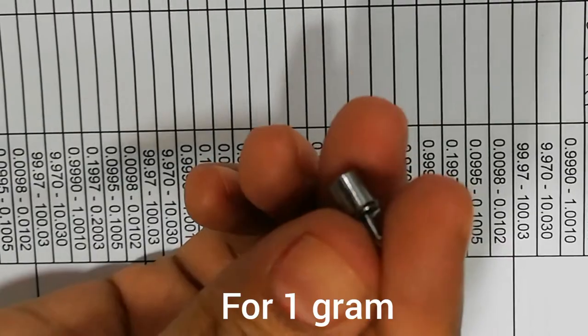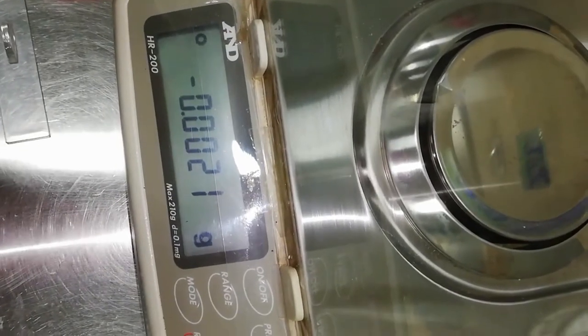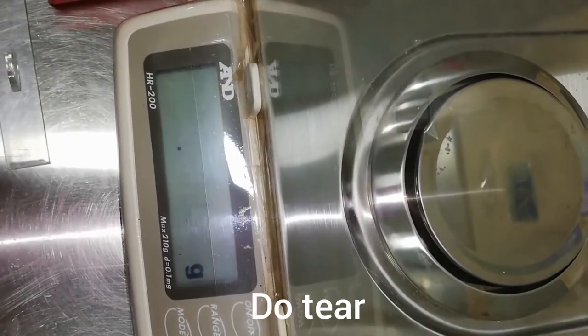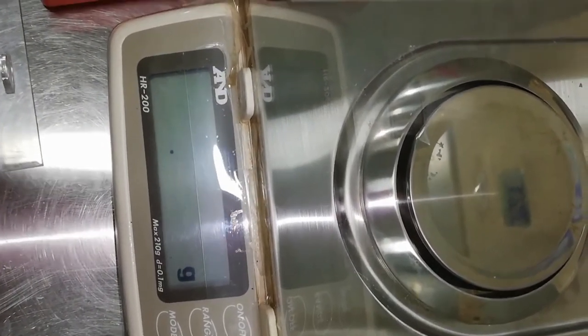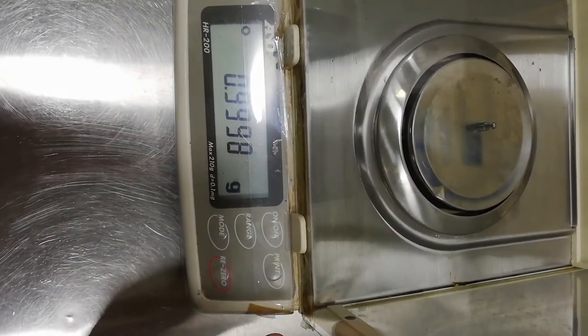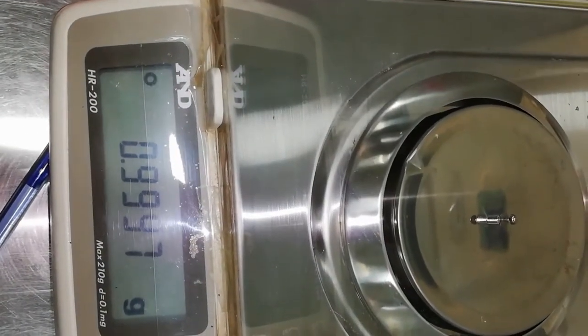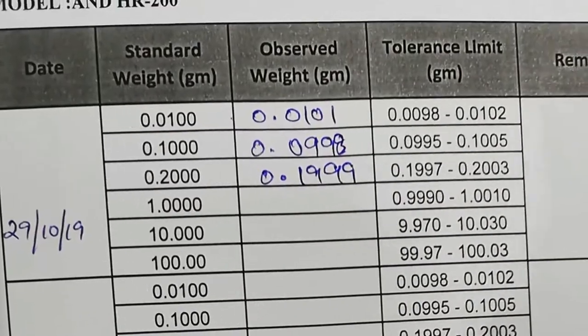This is 1 gram. For 1 gram, I tare the analytical balance first, then put the weight on the weighing scale, slide the door carefully of the analytical balance, read the result, and write it down.